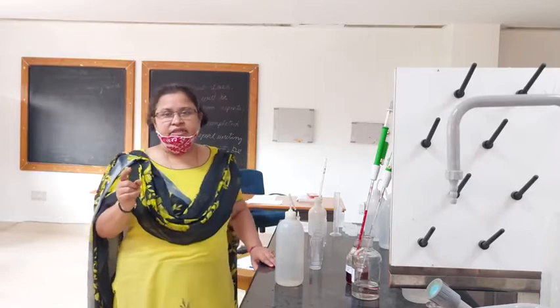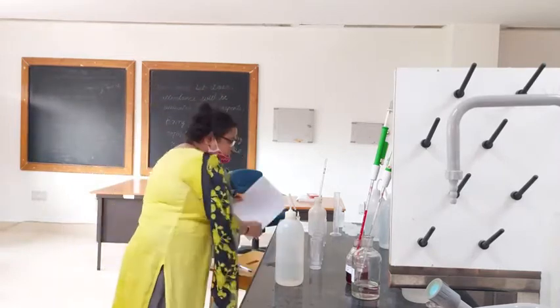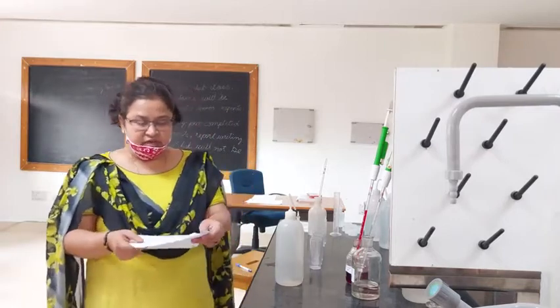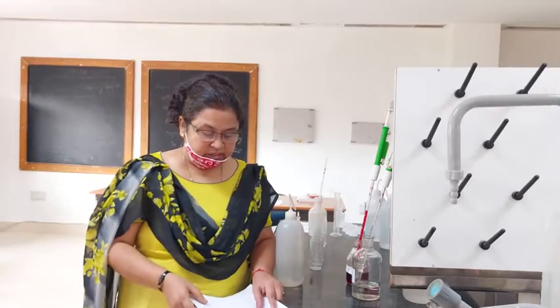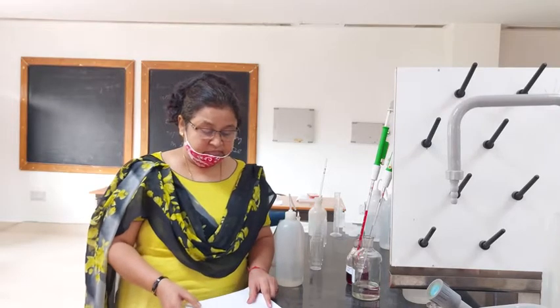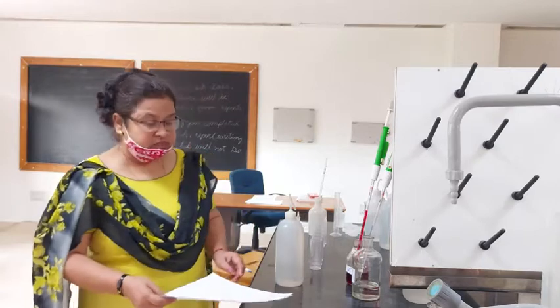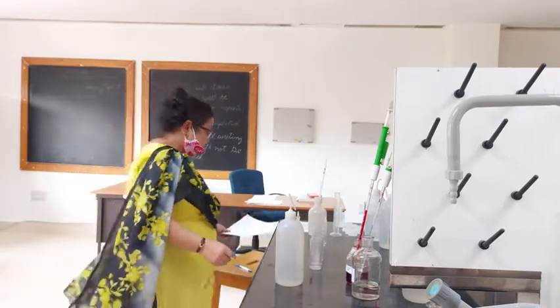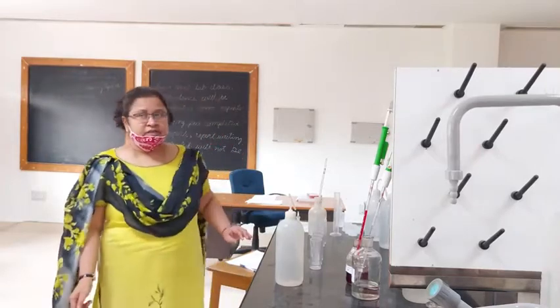How to prepare the standards from the standard fluoride solution? We will use the dilution technique, N1V1 equal to N2V2. N1 is 10, V1 is unknown, N2 is 0.4 milligram per liter, and V2 is 50 ml. Then V1 comes out to be 2 ml. If we take 2 ml of the standard fluoride solution and dilute it to 50 ml with distilled water, then we will get a fluoride concentration of 0.4 milligram per liter.